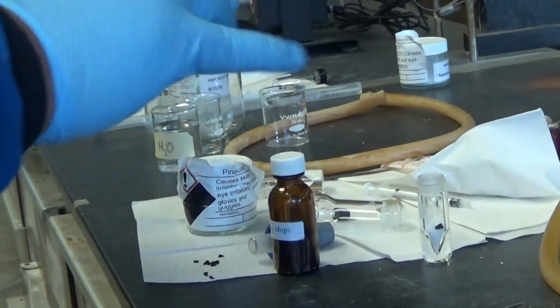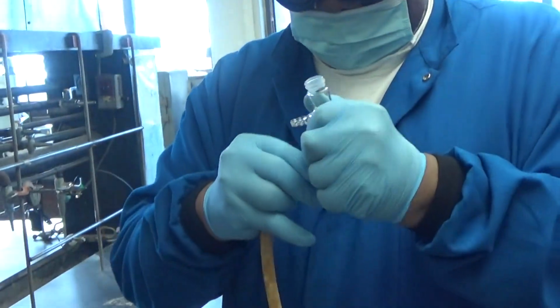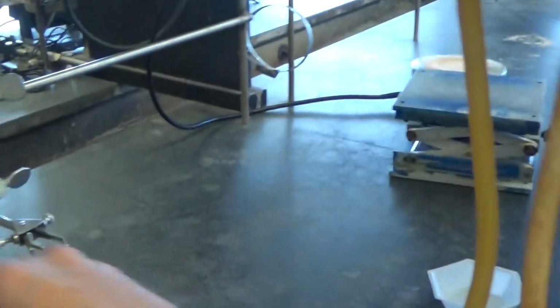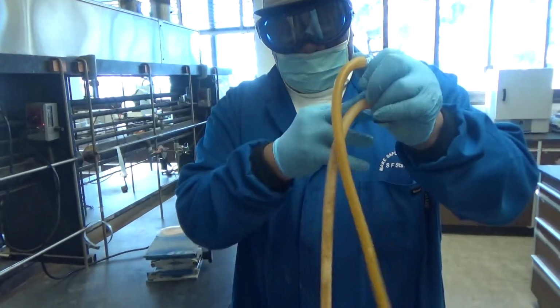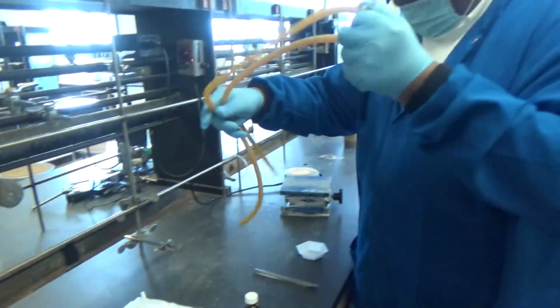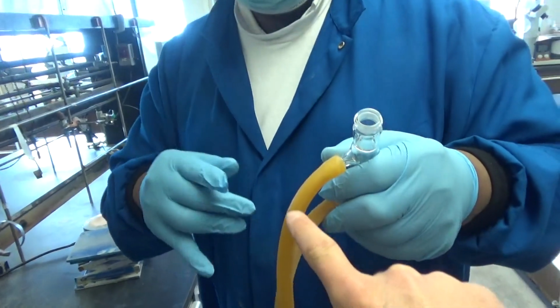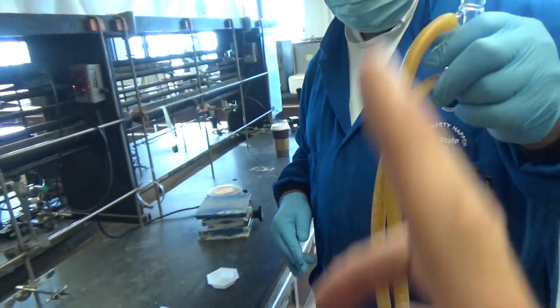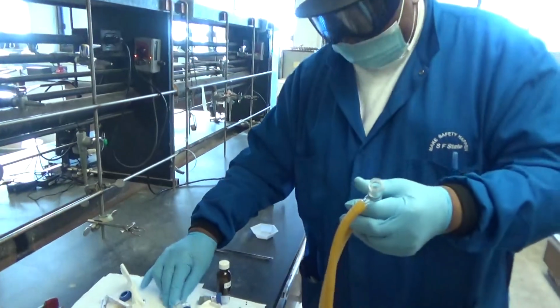So let's first add the hoses here. It's always water in at the bottom and out at the top. Watch out, don't drop it. You put the hose in at the bottom because if the water goes in from the top, it just pours straight down. If you put the water in from the bottom, it fills it up. It's basic physics.